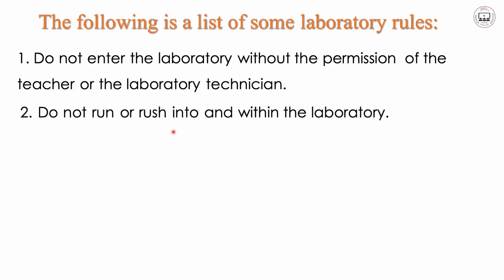Number 2, do not run or rush into and within the laboratory. Why? Because you may damage or break things as you rush, you may fall down, such kind of things. So to avoid that, do not run or rush into or within the laboratory.